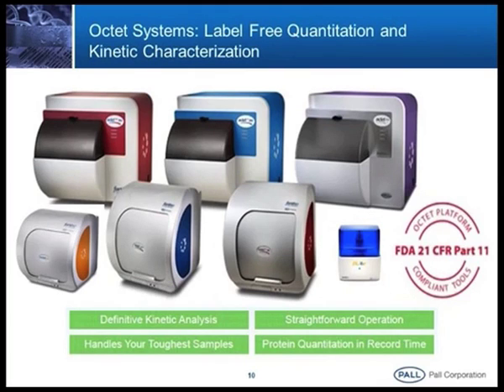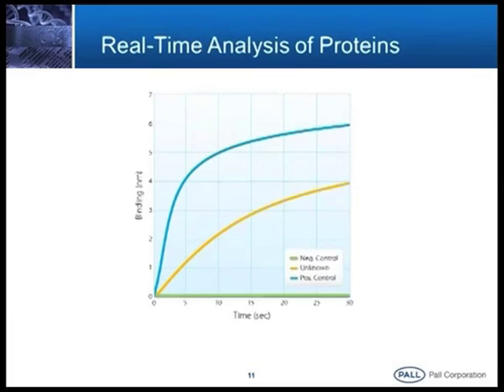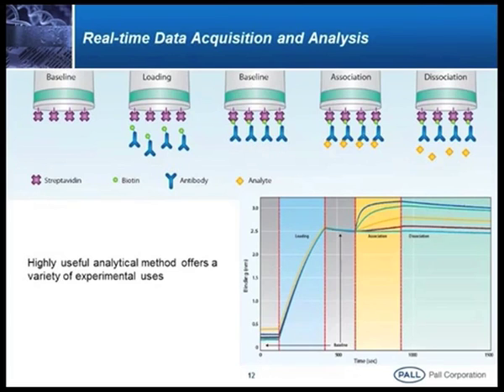So if I put in a 96 well plate, in one stretch it will pick up 96 sensors and go to the 96 well plate. You can read a quantitation in 2 minutes. Such a high throughput level. So this is what the readout is and how it comes, the example I had shown. Kinetics, actually, is how we are performing this kinetics.